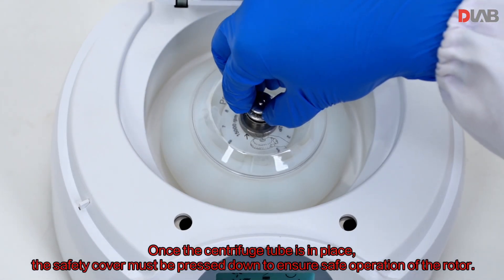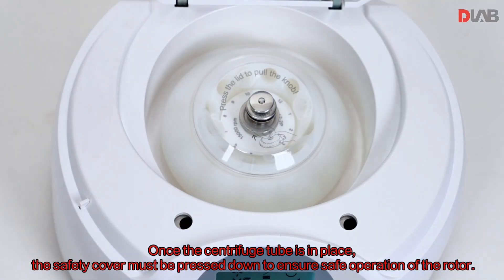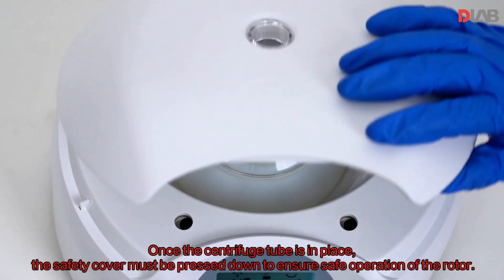Once the centrifuge tube is in place, the safety cover must be pressed down to ensure safe operation of the rotor.